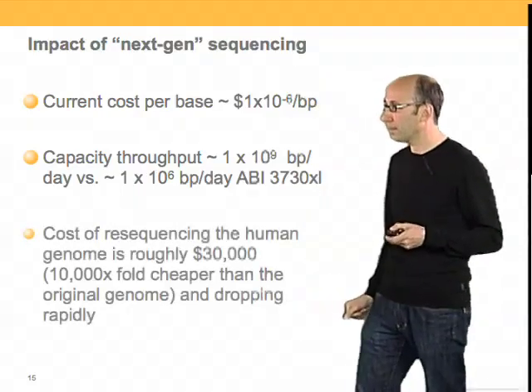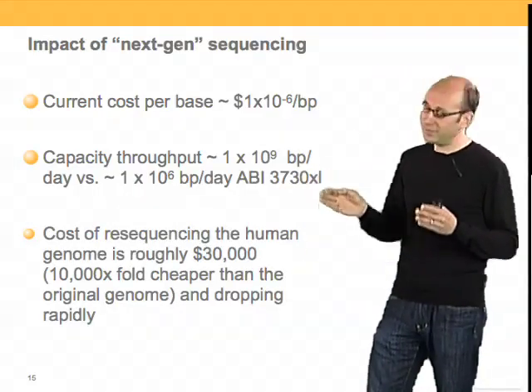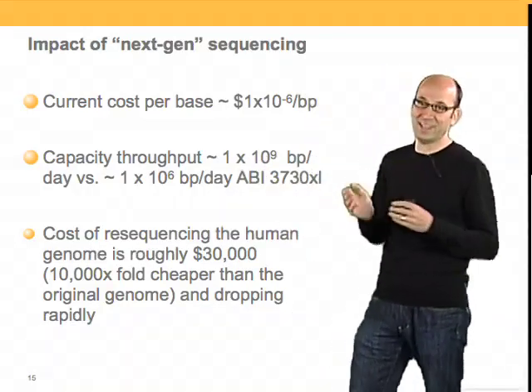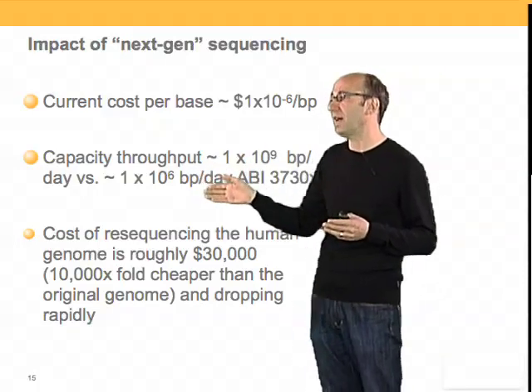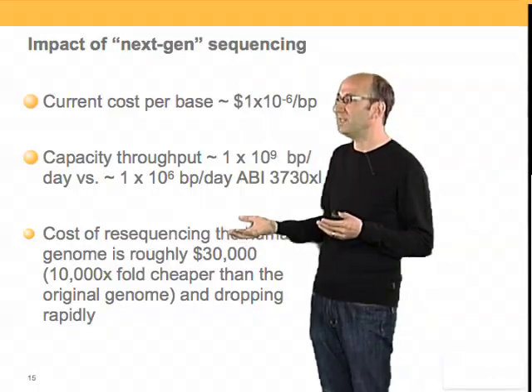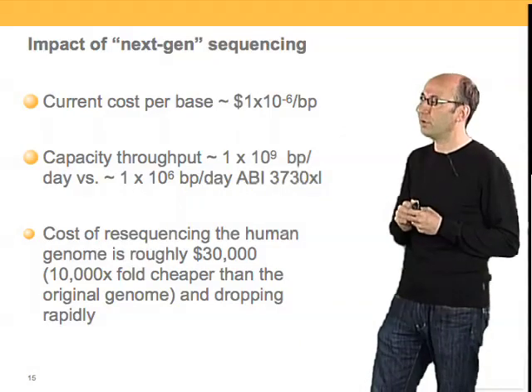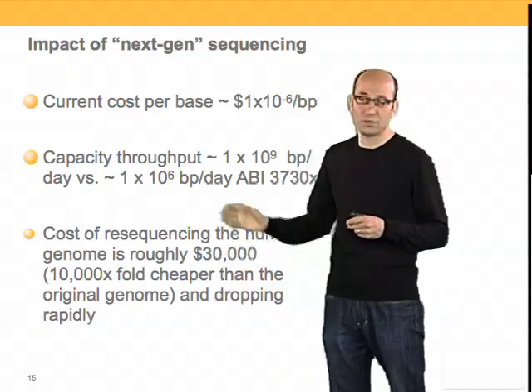And the cost of resequencing a genome today, and today being November 2009, I say that because it's dropping rapidly, is about $30,000. In other words, in going from 300 million to that number of 1,000 that we'd like to reach, we've already gone 10,000-fold of that reduction, and we're within a factor of 30 or so. And as I said, it's dropping rapidly.